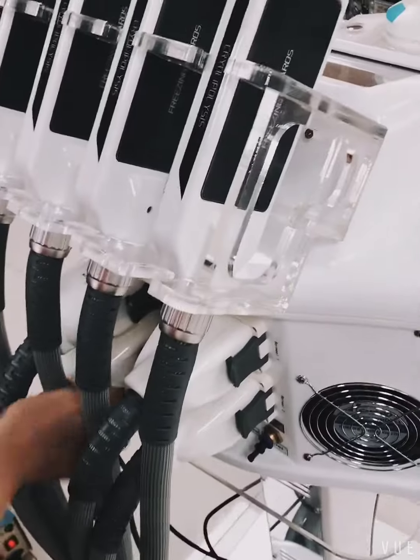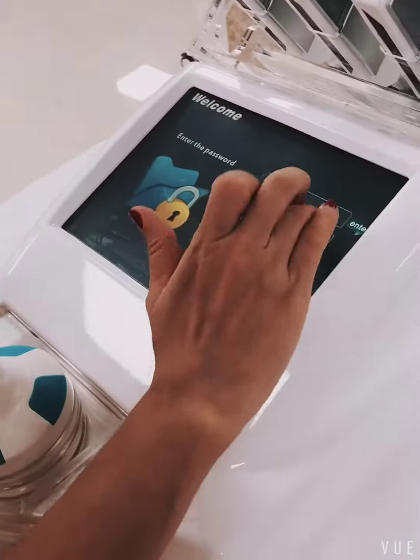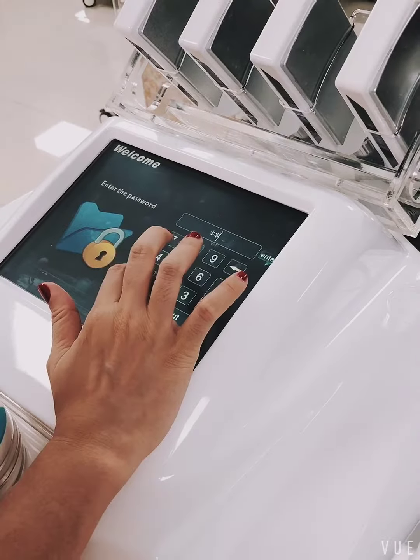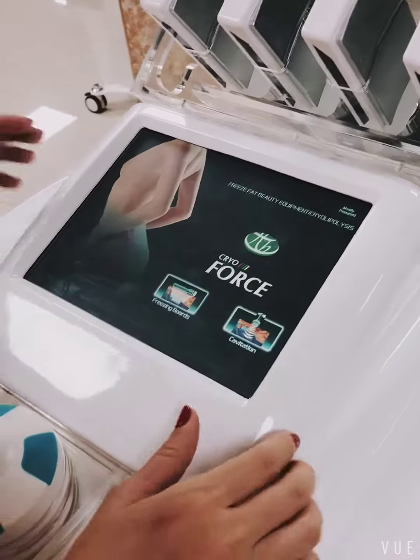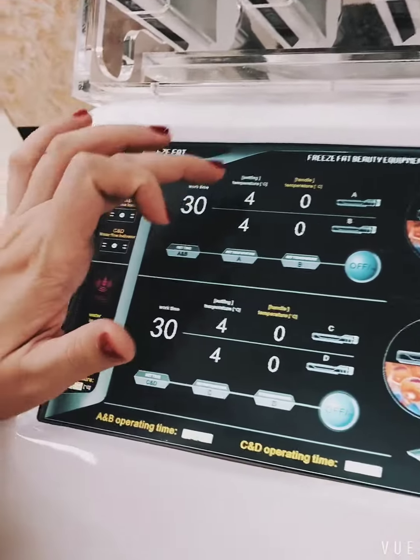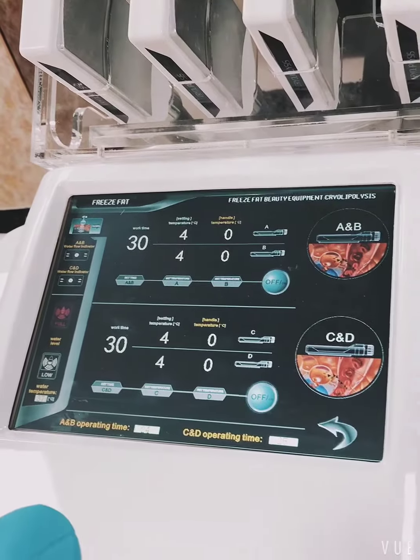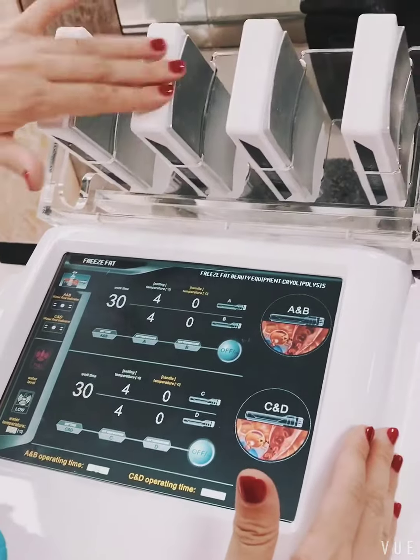So we turn on the power. Choosing the freezing box. This control panel is for the four cryo plates.